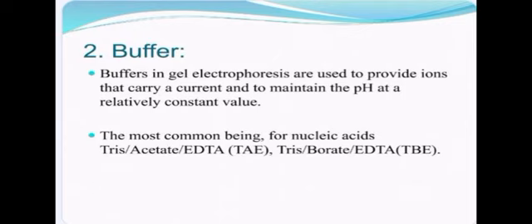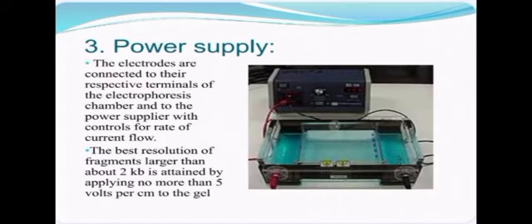What buffers do we use? TAE and TBE. TAE means Tris acetate EDTA and TBE means Tris borate EDTA. This is the buffer. Third instrument, power supply.